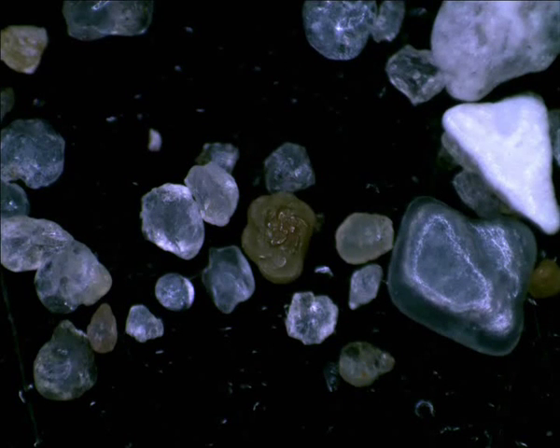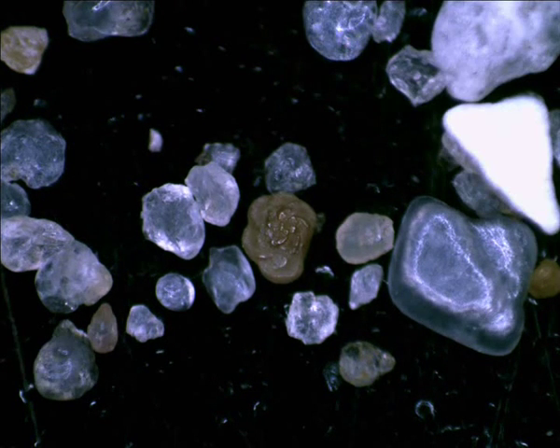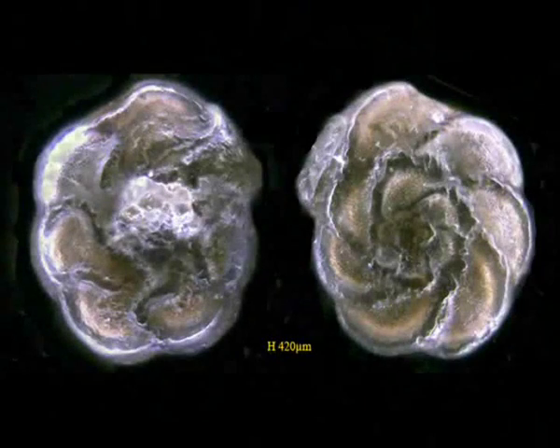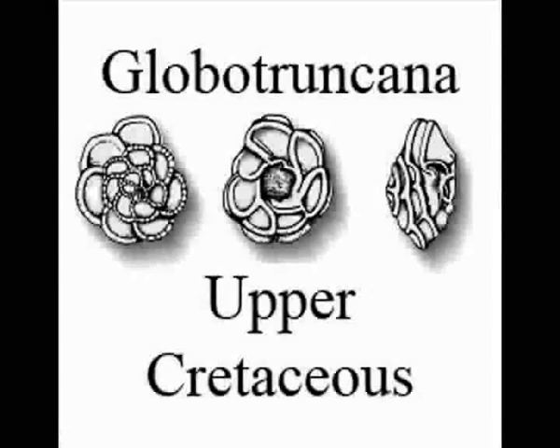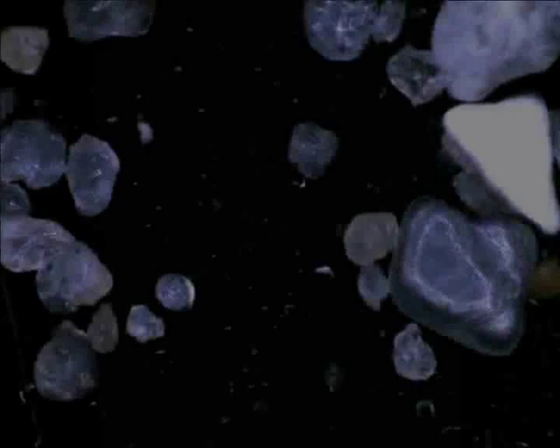There you can see something round, something spiral. With more light we can see it is a kind of spiral and in the middle there are some dots. If we flip it a little bit, we can see a double keel on one side, and the other side looks different — it is a trochospiral foraminifera. The appearance is not very sharp on the edges, just a little rounded. I know this shape only from the Upper Cretaceous as Globotruncana. So we expected a recent Mediterranean beach sample, but this one at least must have been reworked.